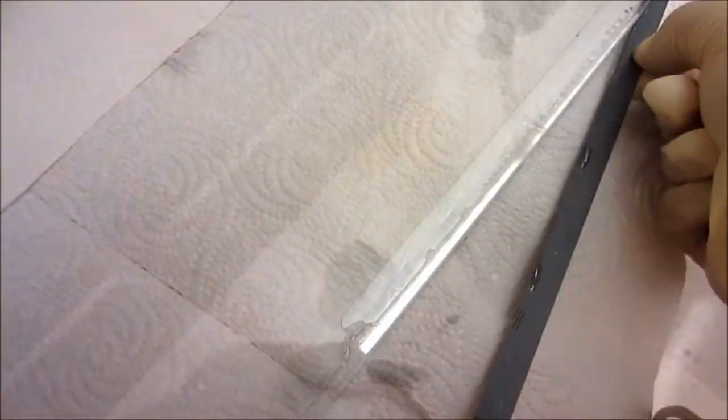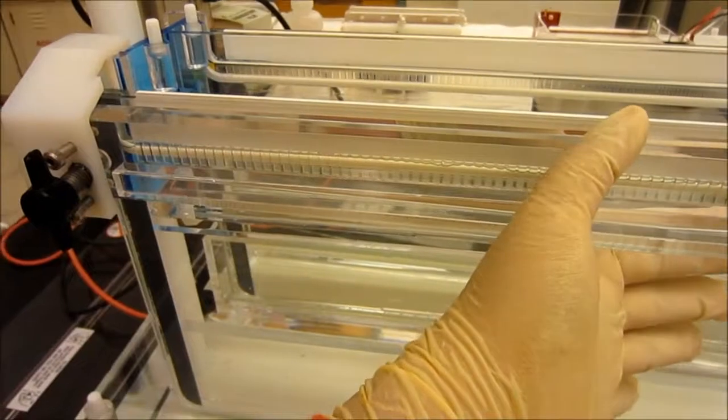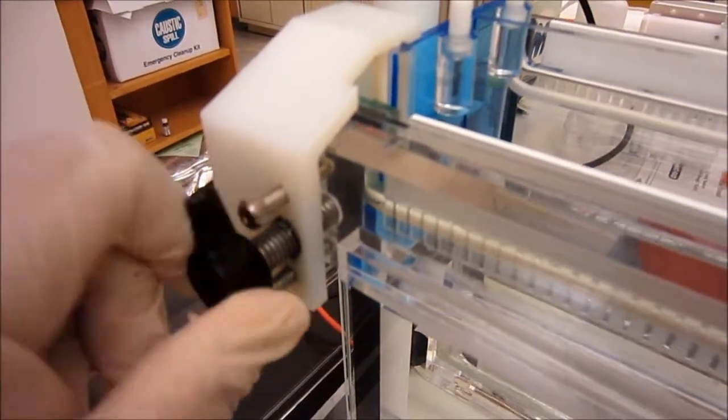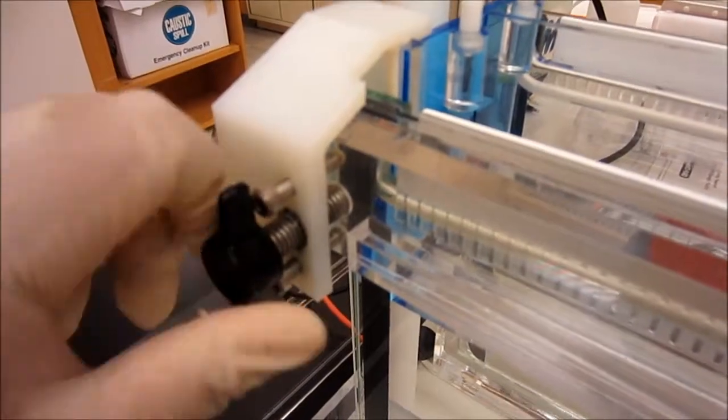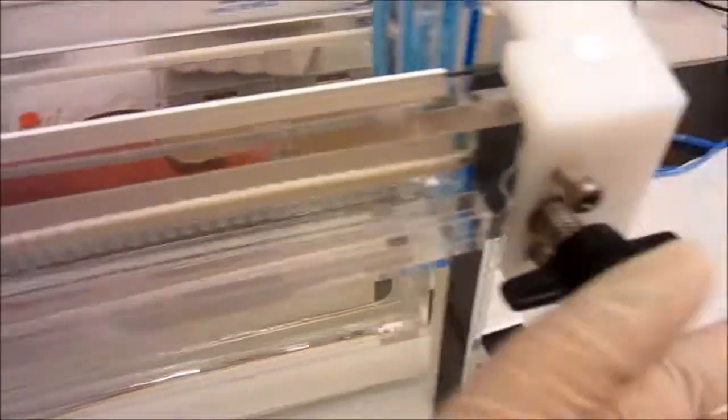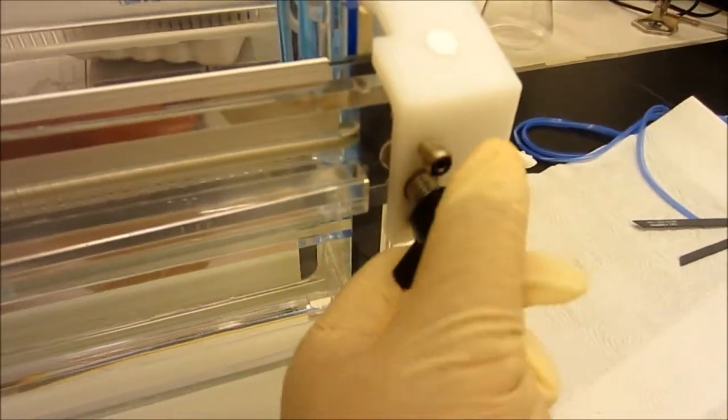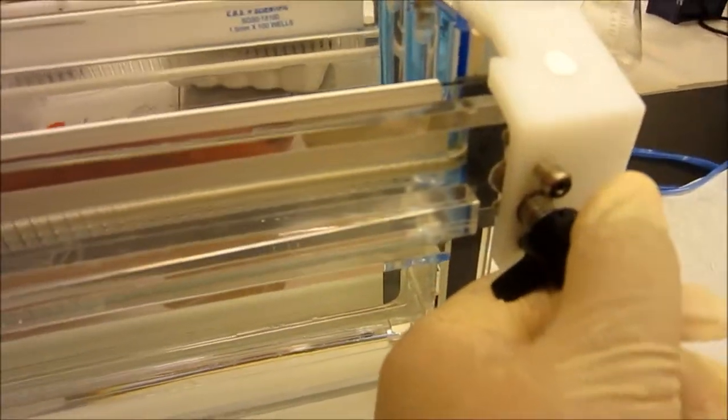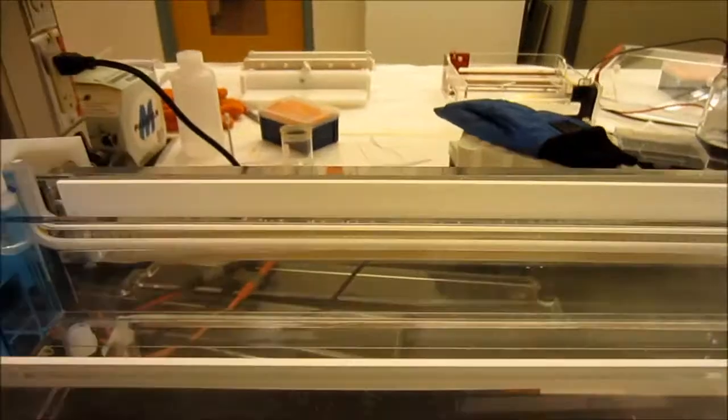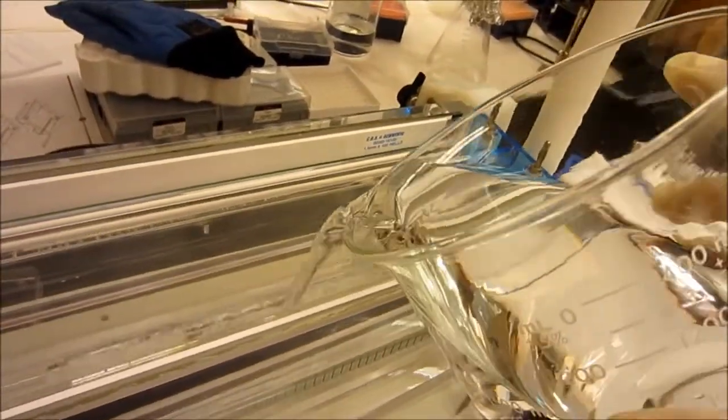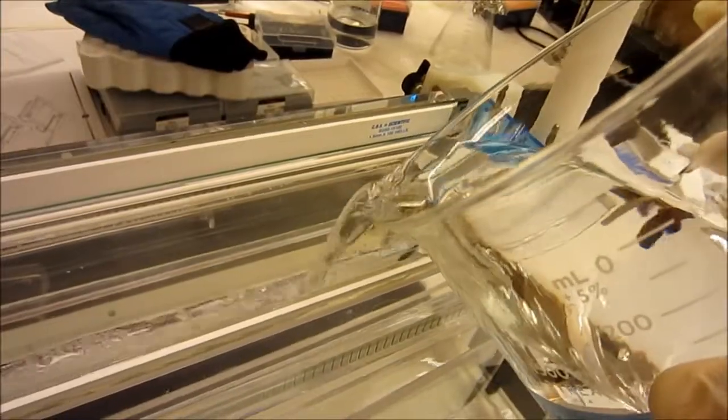The glass slide is then placed against the top reservoir of the vertical gel apparatus, and bar clamp is used to properly secure the glass slide against the top reservoir so that no buffer will leak later. One times TBE buffer is poured into the top reservoir just enough until it covers the PAGE gel.